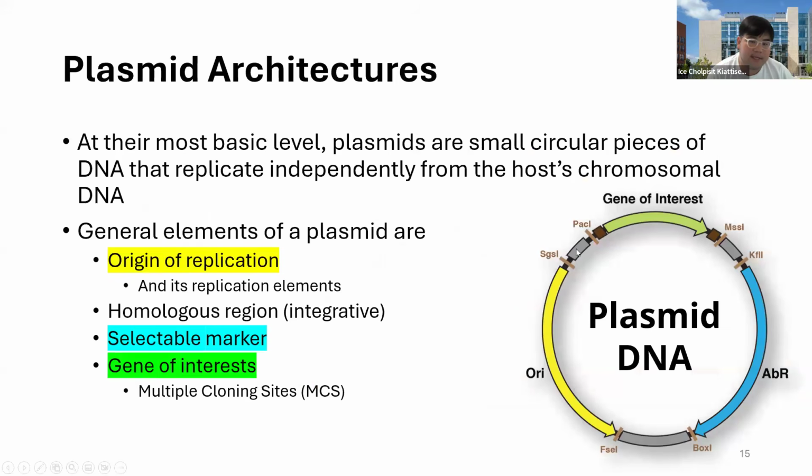And there is also Golden Gate assembly, but I'm not going through that right now, because I just mentioned earlier that it's an improved process of restriction ligation. And again, I'm going to revisit a little bit of the plasmid architecture here: whenever you are trying to clone something, you probably need three pieces of DNA to make the plasmid that you put into any bacteria.